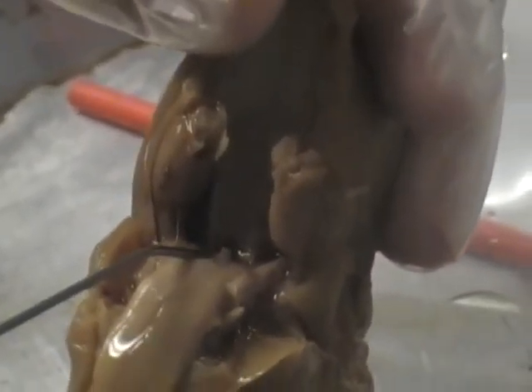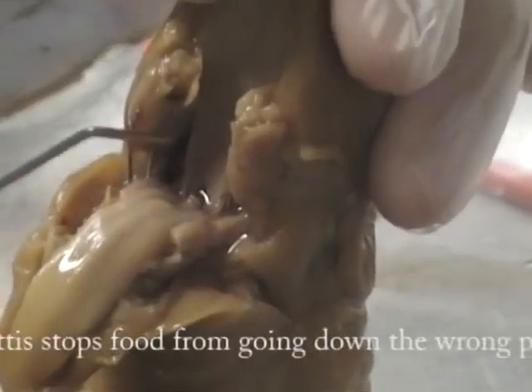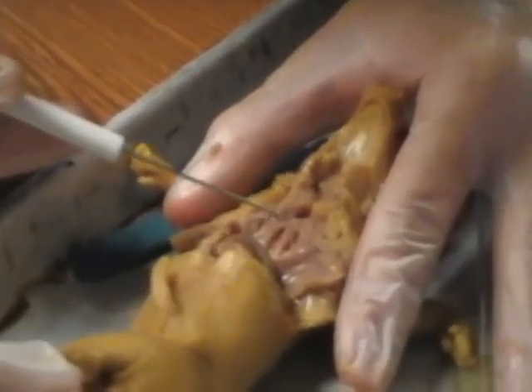So back here is the epiglottis, and this stops food from going down the wrong pipe. So instead of going down the trachea, it keeps it going down the esophagus. This pipe right here, that's the esophagus.